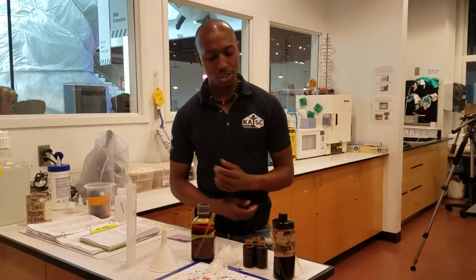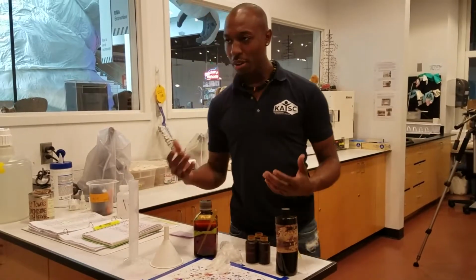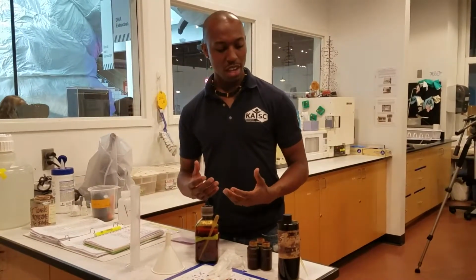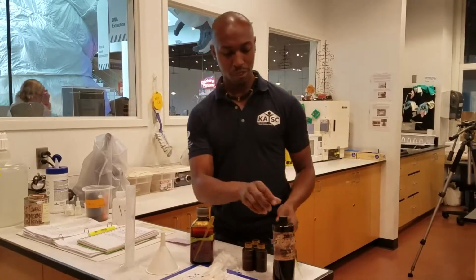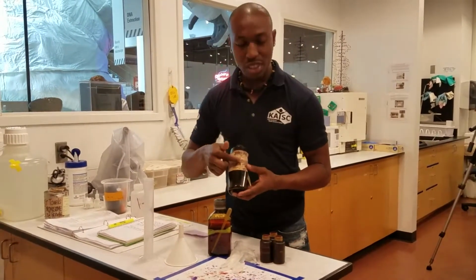This experiment and procedure is called diluting iodine, okay? Like I was talking about the 100% source, what I'm telling you, guys, is that it's 100% glucose or 100% bleach. It is what it is, 100%. It's not diluted. Right here in cabinet 1 I got this from is the Lugols solution.